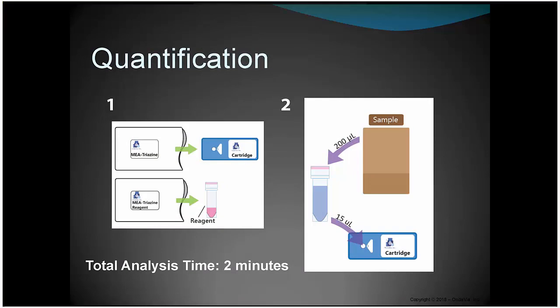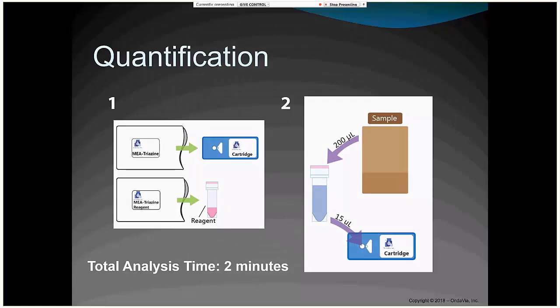To this day, I'll do a presentation on Raman, and someone will say, it's a great technique for identification, you can't quantify. The approach for quantification with Raman is to have a material that's an internal standard, mix your sample with that internal standard, and measure it in the Raman spectrometer. With the right software, with the right data processing techniques on a computer or within a device, you can then make Raman a quantifiable method, a method for quantification, I should say.